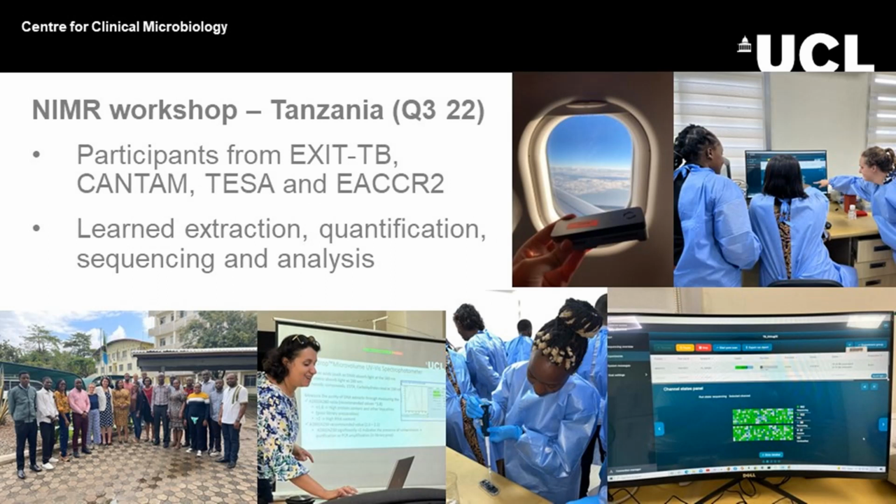So you need stable power for all of that time. You also need internet connection for all of that time, but especially at the beginning, because when you start a sequencing run, your computer connects to the Nanopore servers to download drivers and things like that. Unless you have the Mark 1C version of that Nanopore, which doesn't require the internet because it's kind of like a little handheld computer. You also have to consider the analysis programs that you're using as well. So if you're doing command line interface ones, then obviously that's just on your computer. But if you're uploading them to the cloud or to the browser, then you need the internet.